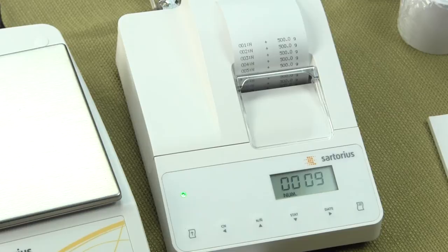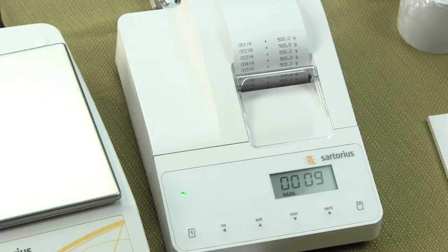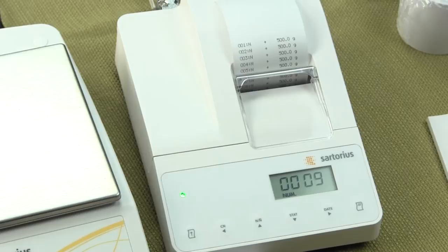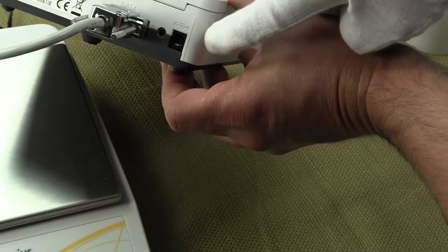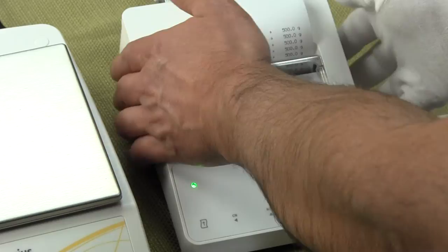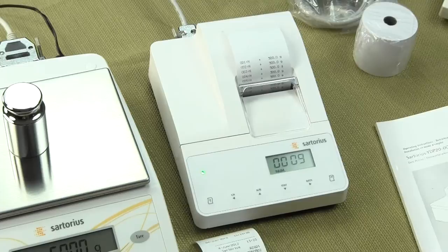The printer comes with the ribbon cable and also the printer cable. The printer is powered through the balance itself. This printer only works with a Sartorius balance outfitted with an RS-232. If you are using this printer with an explosion-proof balance from Sartorius, there is an optional AC adapter that you would have to purchase — you can see the spot for it on the back. Give us a call and we'll get you the right parts for that.